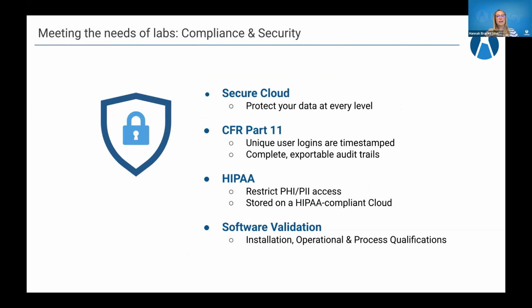All of this, of course, is underlined by the fact that we want to ensure compliance and security needs for all of the labs at every level. And so ensuring that your data is secure and encrypted on our cloud environments, ensuring that we have support for CFR Part 11 compliance with our very extensive audit trails and timestamp capabilities, as well as supporting HIPAA compliant environments where you can restrict PHI or PII access as needed, and being able to store that on an even more secure HIPAA compliant cloud environment.